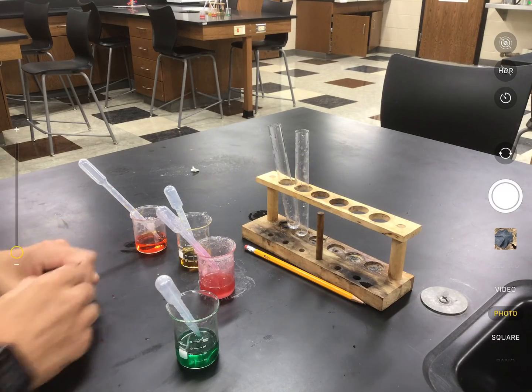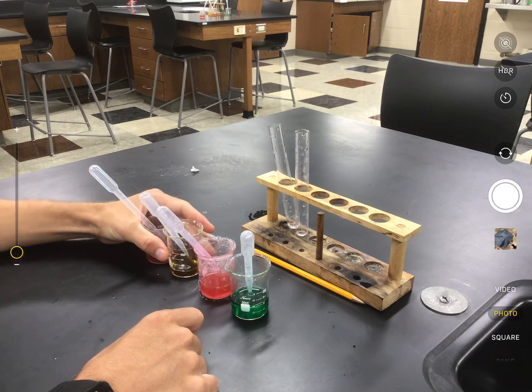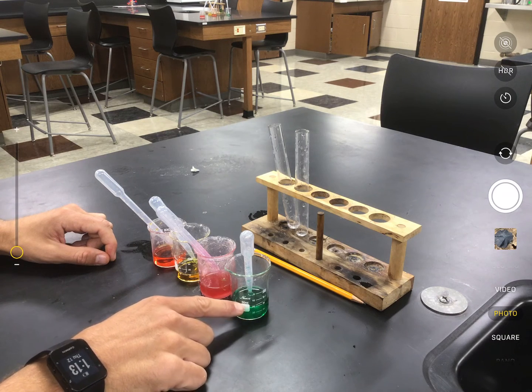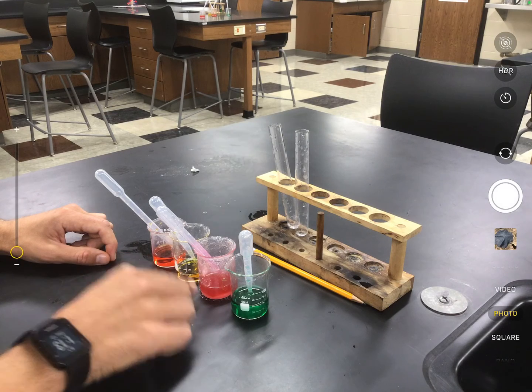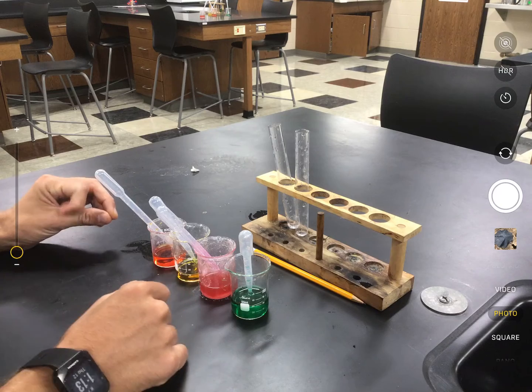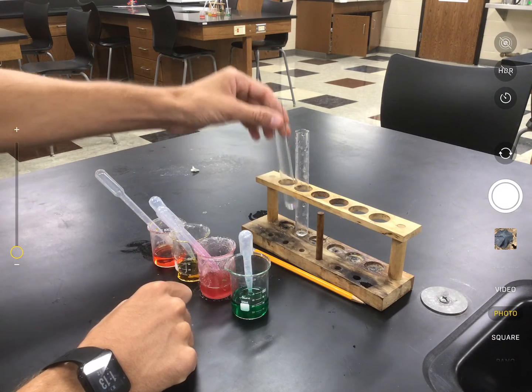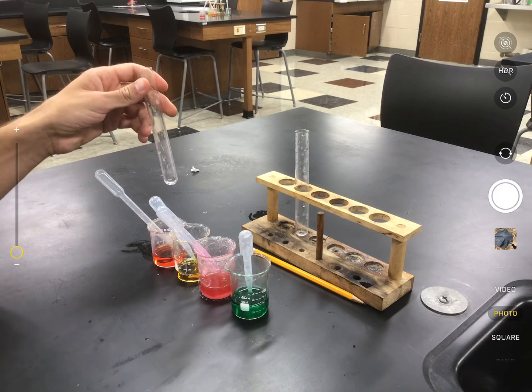And the thing about density is in a set volume, so these have been used by a few classes, so the volumes are different. But basically, density means that if all of these have the same level of liquid, some of these have more mass in that level of liquid. And that's still true. So what we'll do is first, in no random order, we'll just put different colors of fluids in here and see which one's on top.